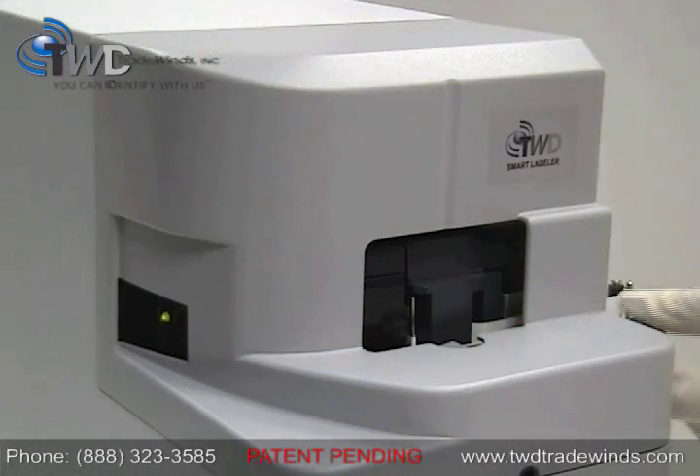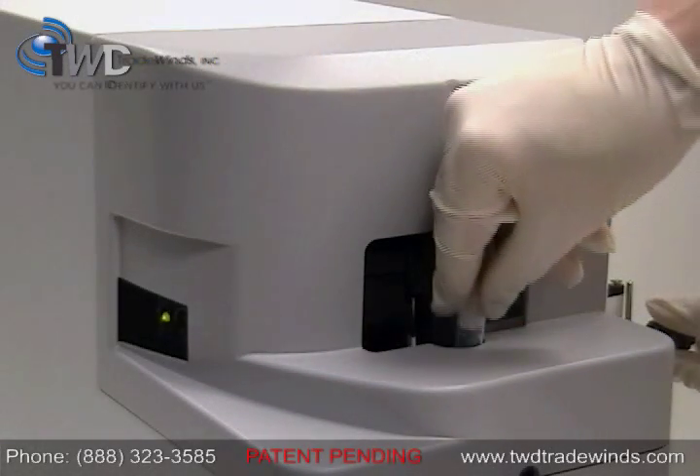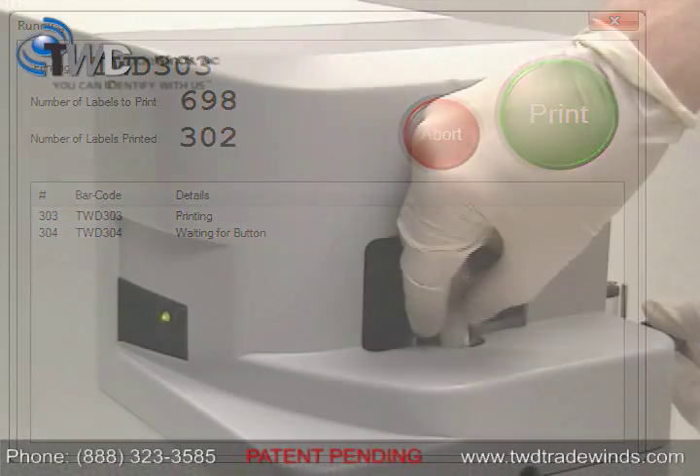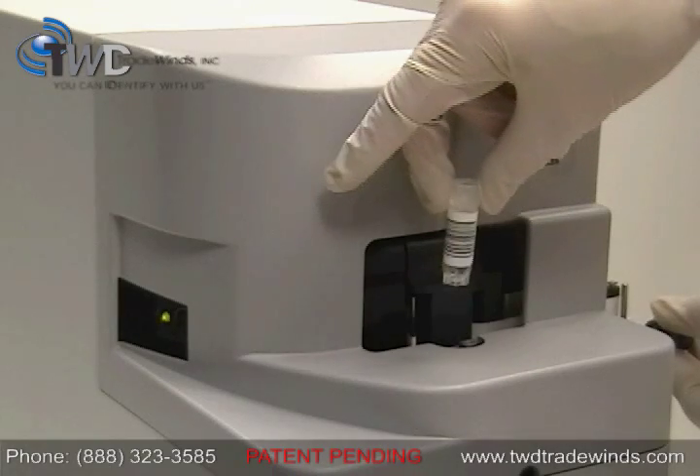Make sure your labware is loaded into the machine and the power is on. Then click the print button in the software. Your custom label is now applied and ready for use.